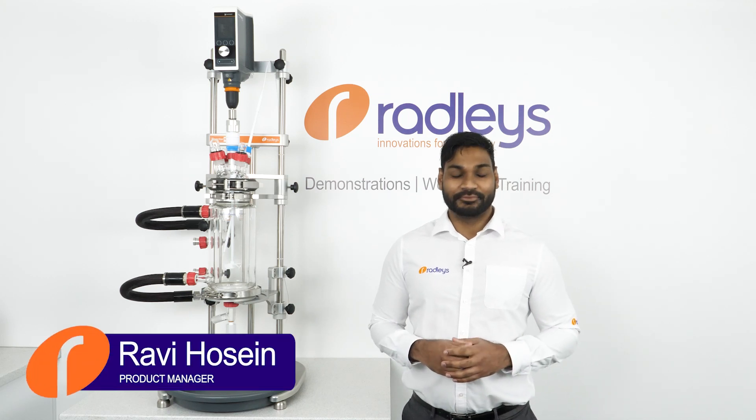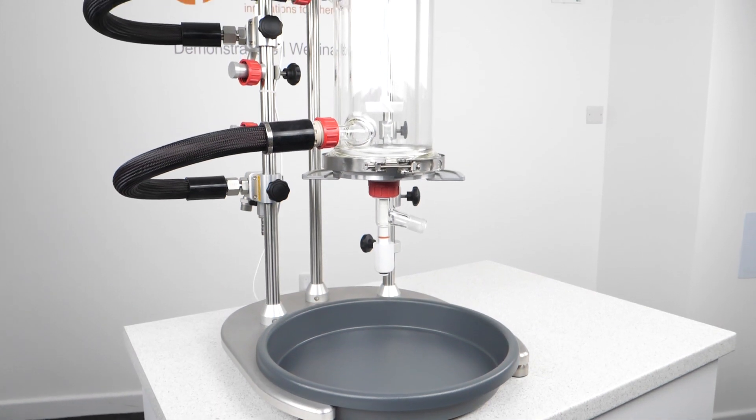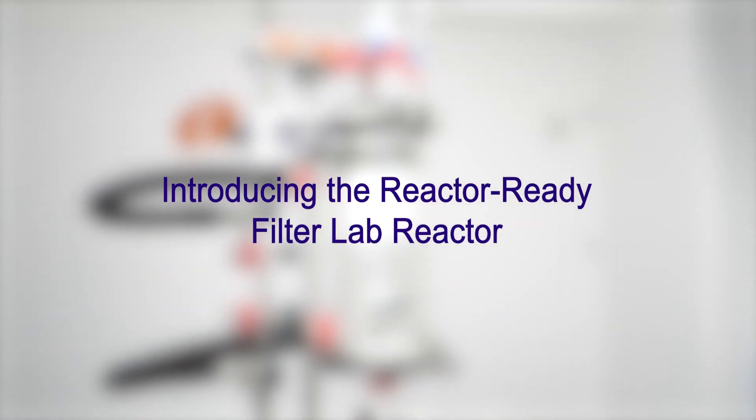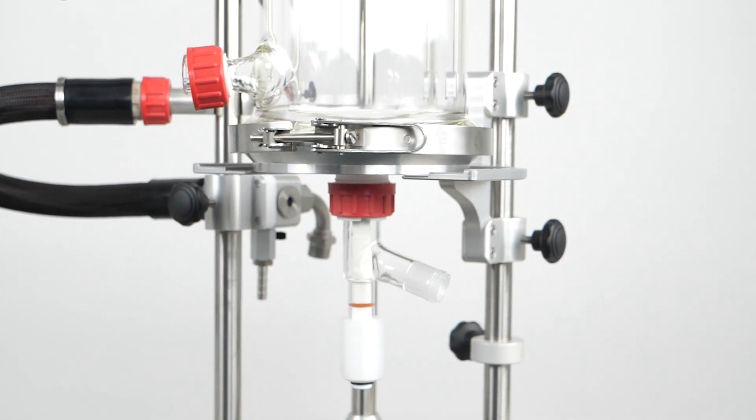Today I'm going to be showing you the Radley's Reactor Ready Jacketed Lab Filter Reactor. I'll be describing the range and its features, talking about some applications for our filter vessels, and giving you a short demonstration on how to set up and use the system.